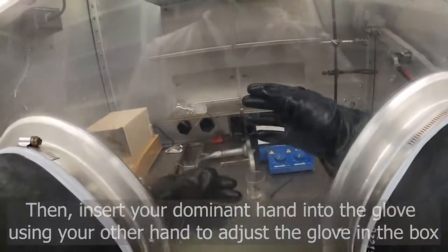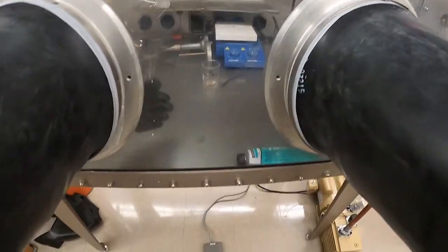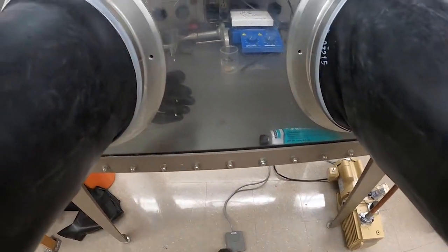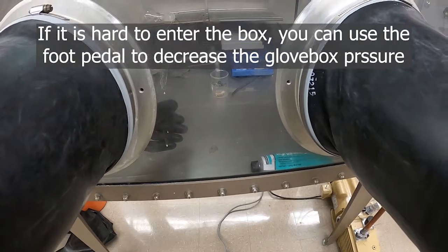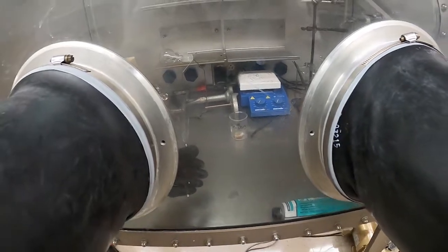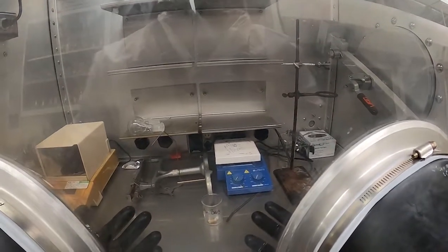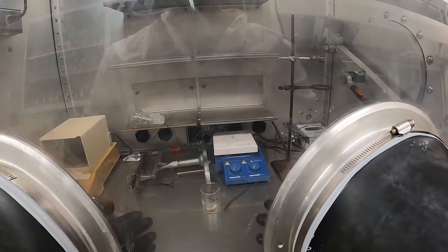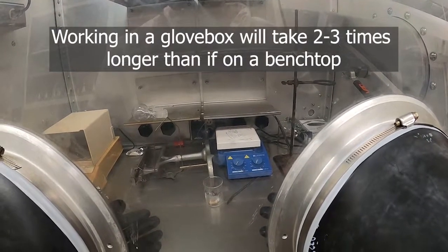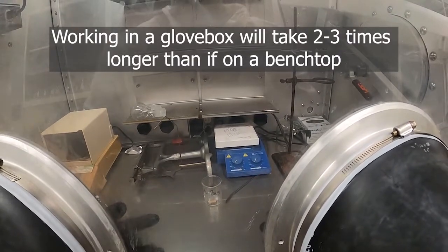If you're tall this can be difficult, because you'll have to squat down to give your arm enough room to push forward. If you're smaller it can be easier, but you might want to adjust the pressure — the left pedal decreases the pressure, the right increases it. Remember again that any time you're working in the box, it's going to take two to three times longer than you'd expect or than it would working outside of the box.